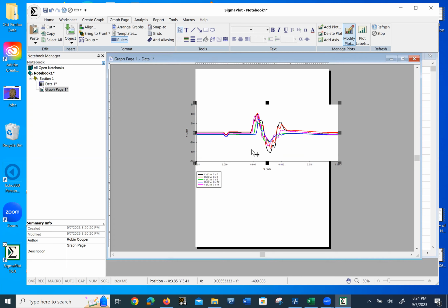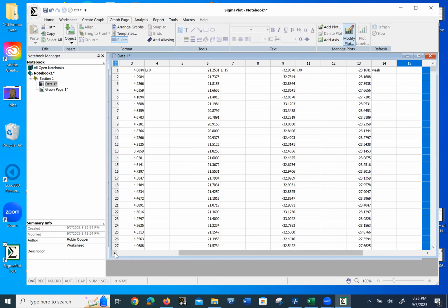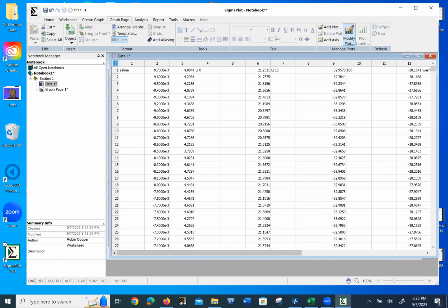That's beautiful. These are superimposing the stimulus artifact. The compound action potentials right here. We can see the amplitude changes, but the axis is changing here. So it's kind of hard to know if the amplitude's going up, but you've taken those measures in the last recording. But for graphic purposes, it might be better to have them all superimposed on the same line.